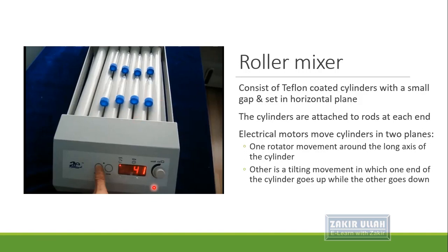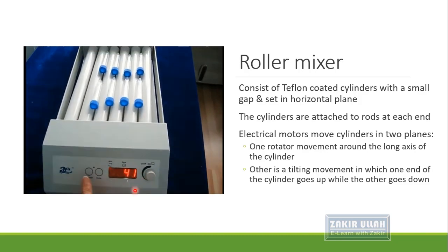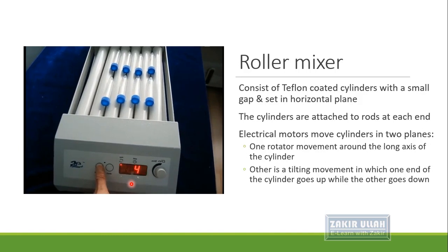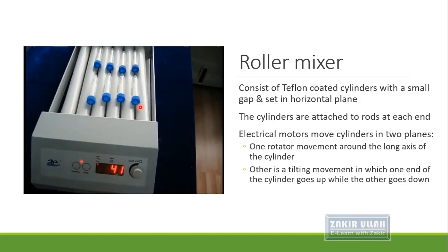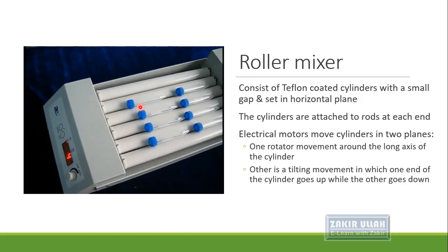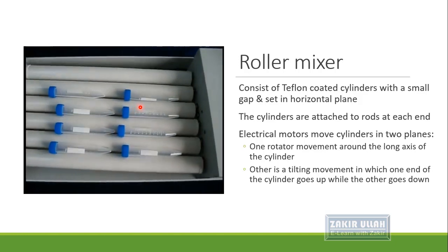The roller mixer has a display bar, a regulator, and increase/decrease buttons. The cylinders coated with Teflon are visible on the unit. A timer and rotation speed (RPM) are set inside the display bar and connected to the motor. First we set the time for how long the tubes are to be rotated and mixed. The cylinders show two types of motion: rotation and tilting.